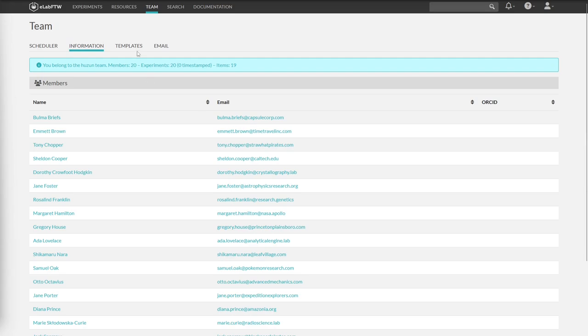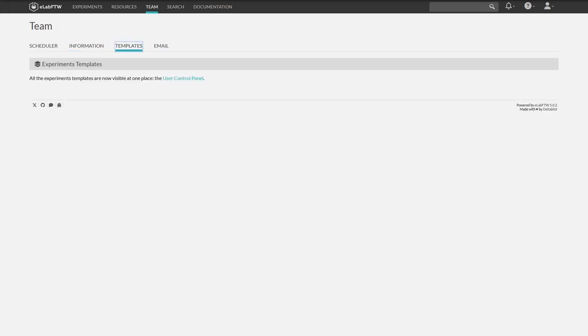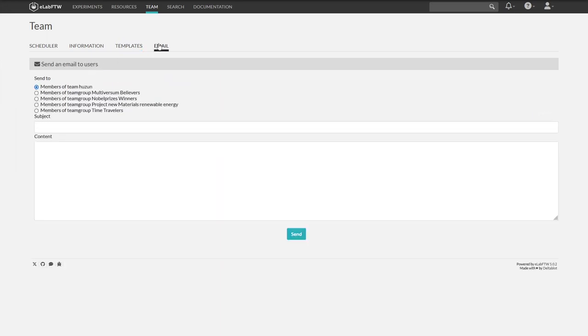A separate video will be available for templates. So let's move on to the last point, email.